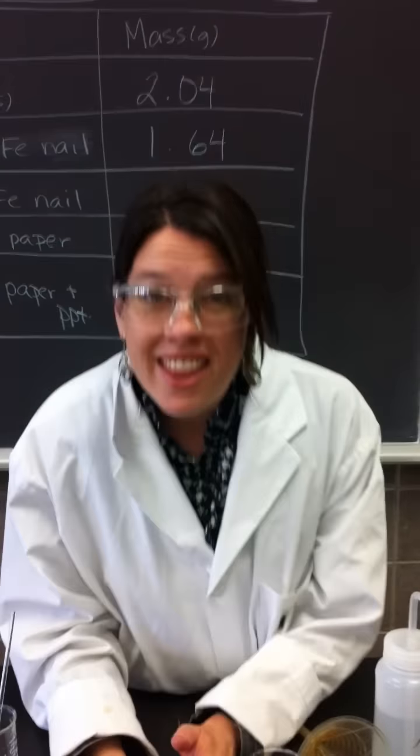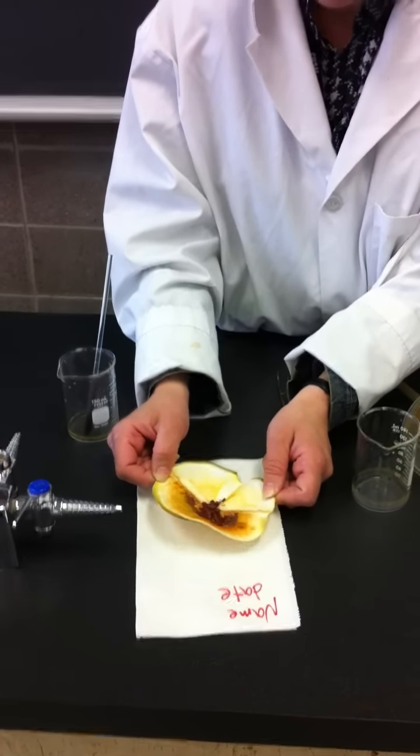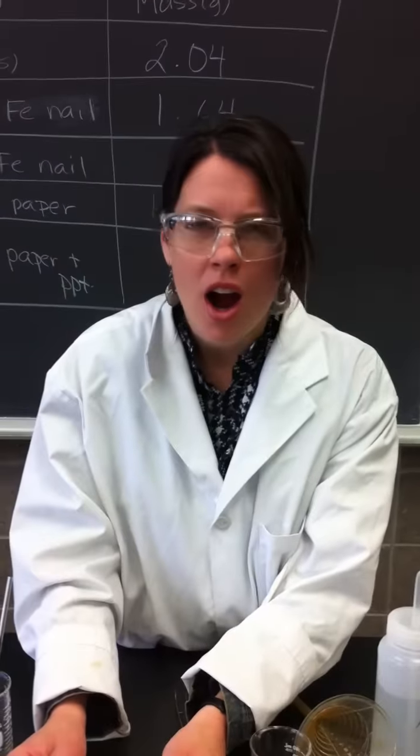Okay, so then the fun begins, because now you're going to take your mass and do some stoichiometry, and you will solve the puzzle. Iron 2 or iron 3?